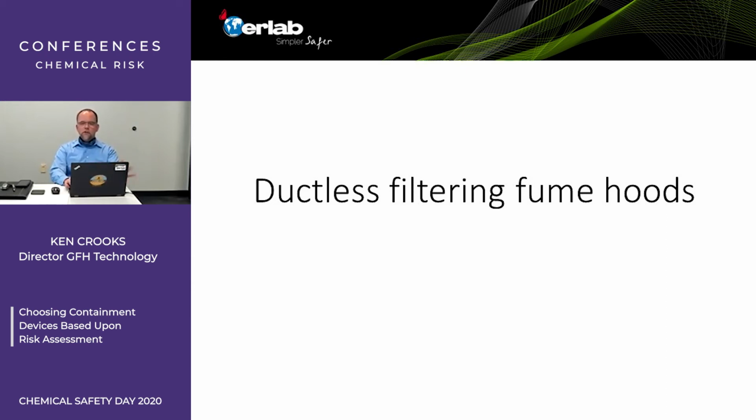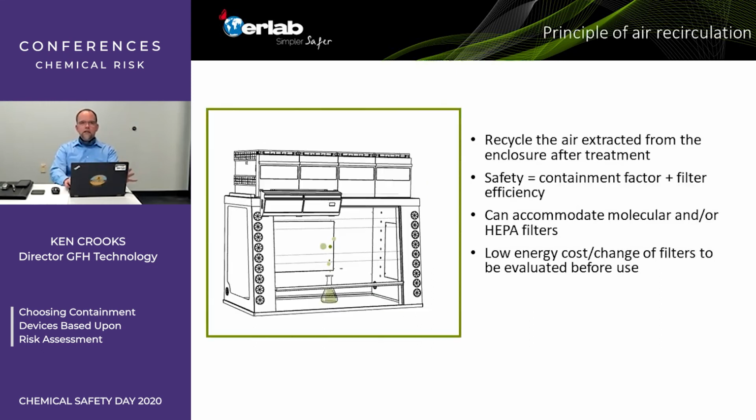But for others, for low dosage and lower risks, yes, we can certainly look at the use of recycling the air. So the fans and the filters are right directly on top of the fume hood, clean that air and return cleaner air to the laboratory than actually went in the open sash to begin with, never mind the chemistry being performed inside that fume hood. And total safety is both the containment factor of the fume hood enclosure, whether it's ducted or ductless, plus the filter efficiency. So obviously you want to make sure that the filters are the appropriate filters and have the efficiency needed for this specific application.